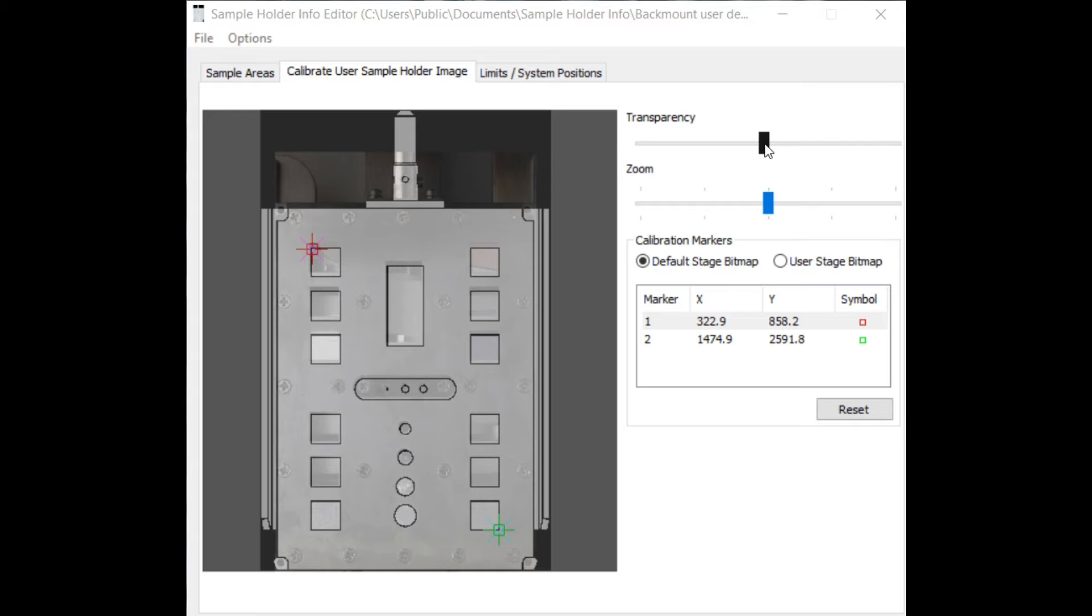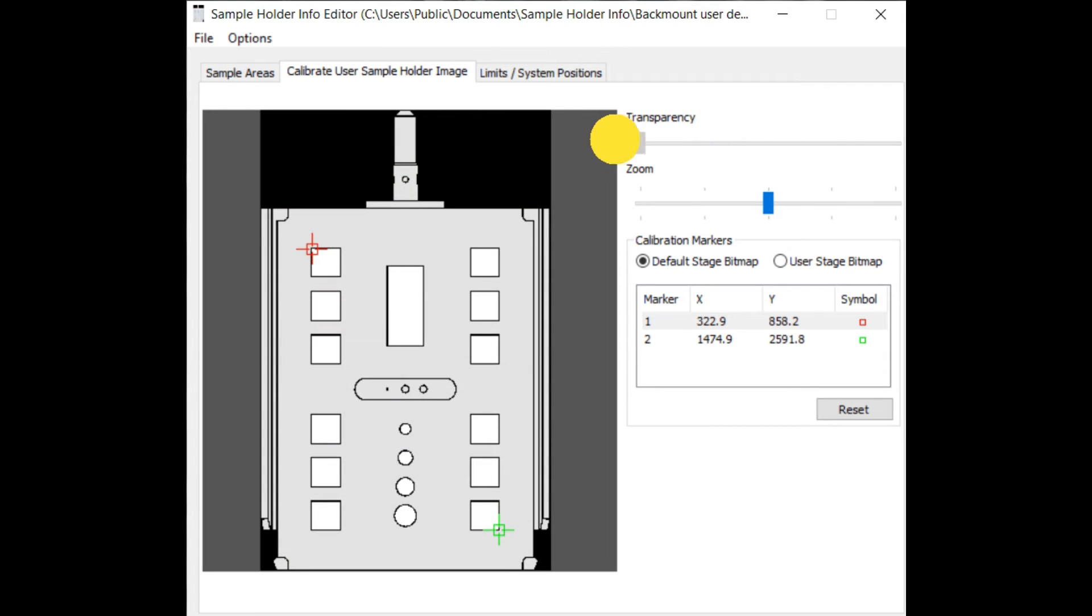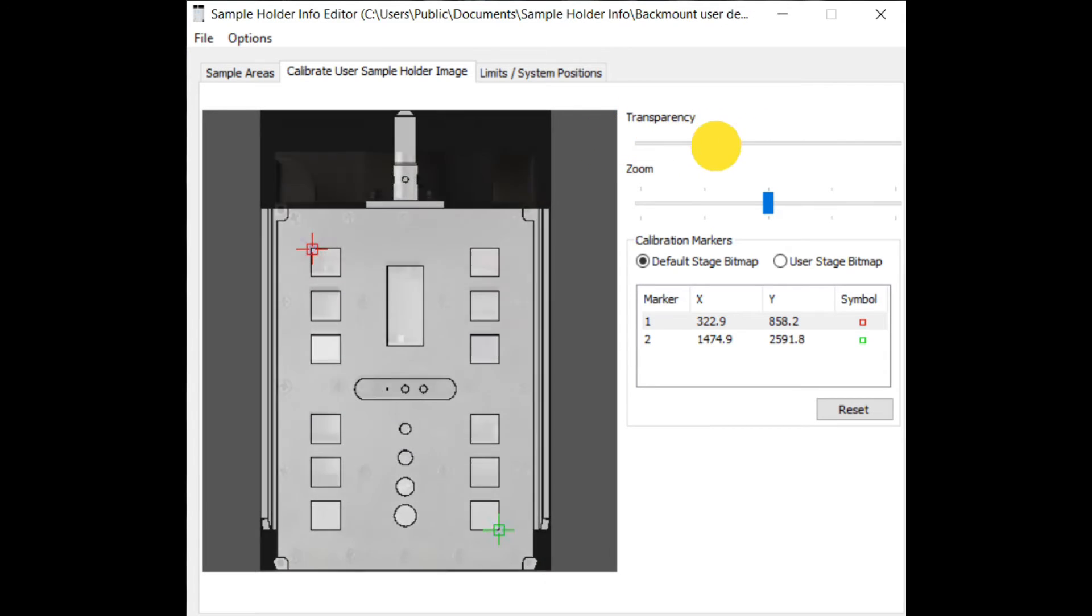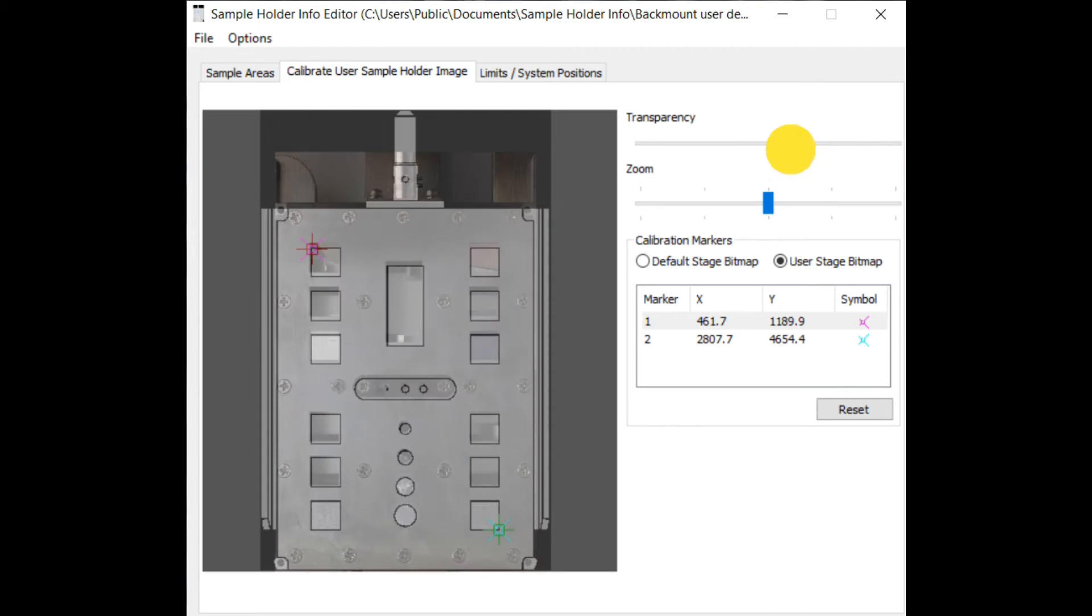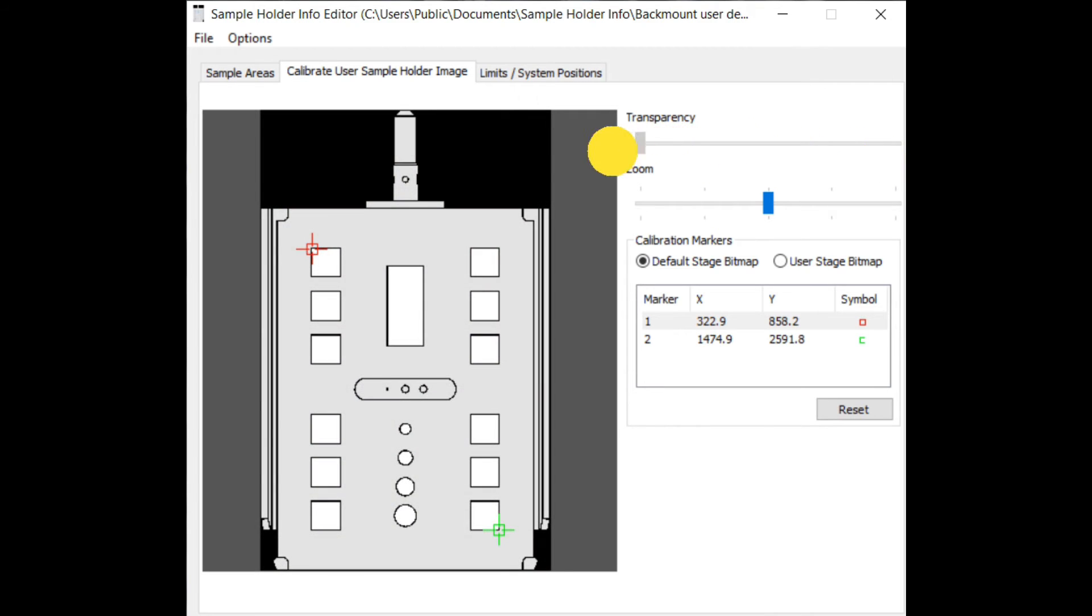It might be necessary to calibrate the photo against the default image. Move the transparency slider to either select the default image or the photo of the sample holder.